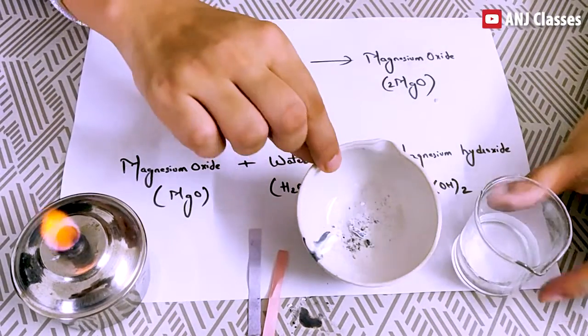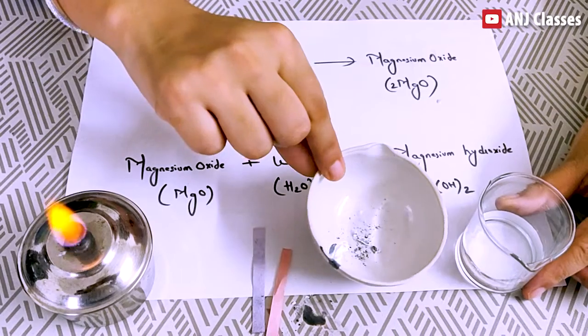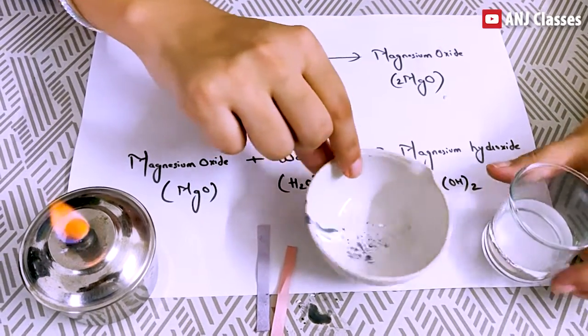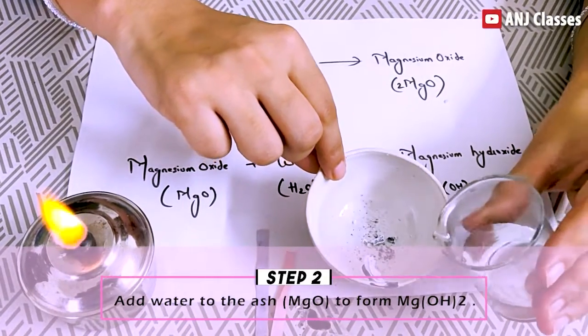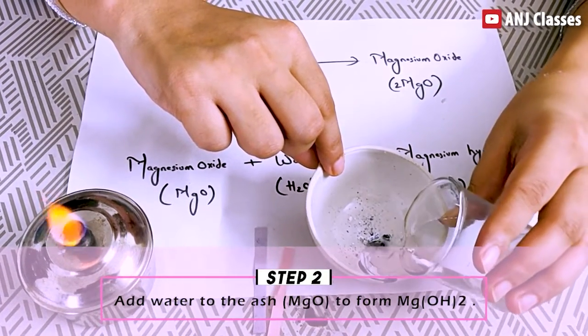Now you can see here it is magnesium oxide and now I will add few drops of water to form magnesium hydroxide.